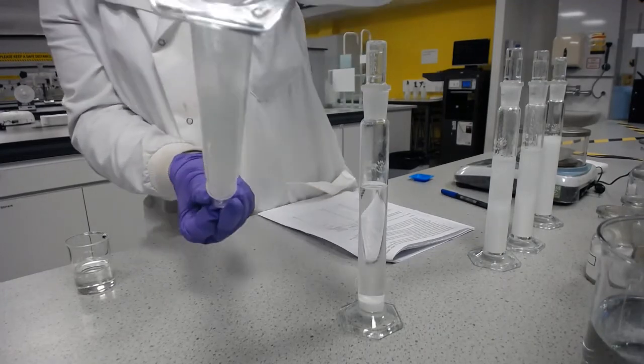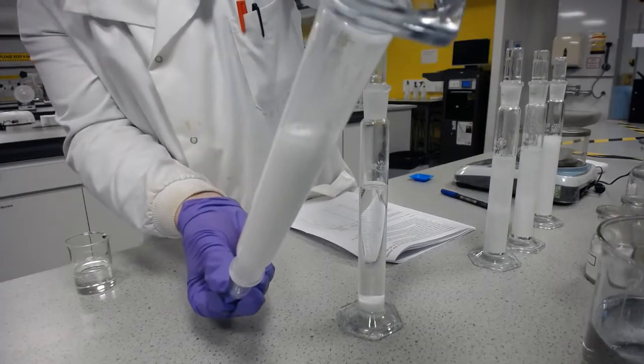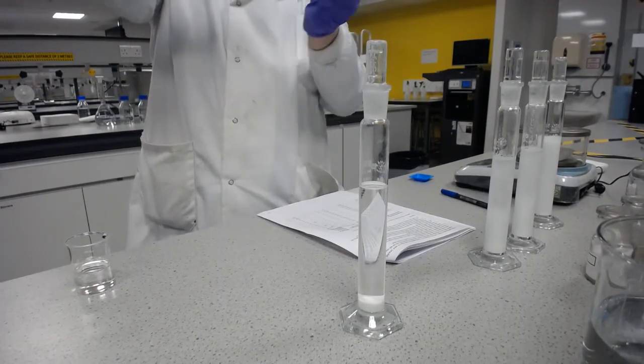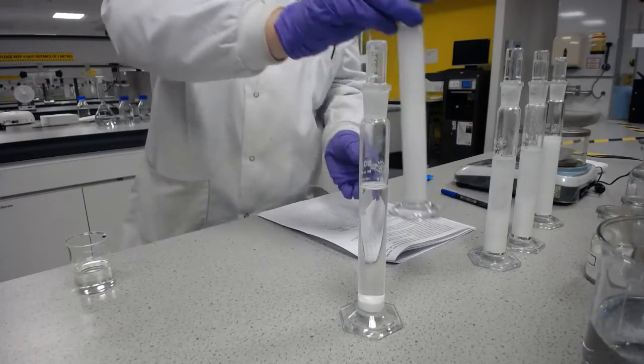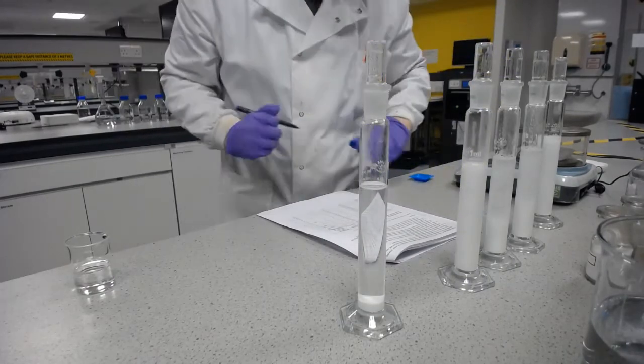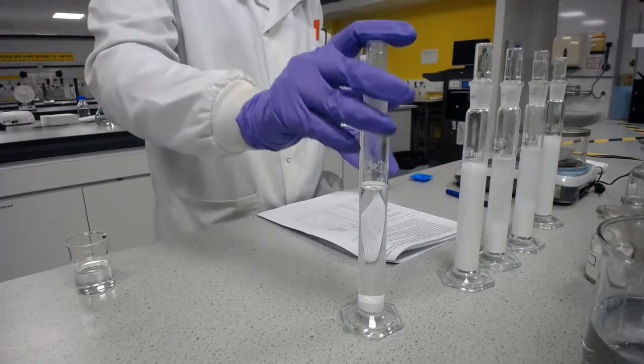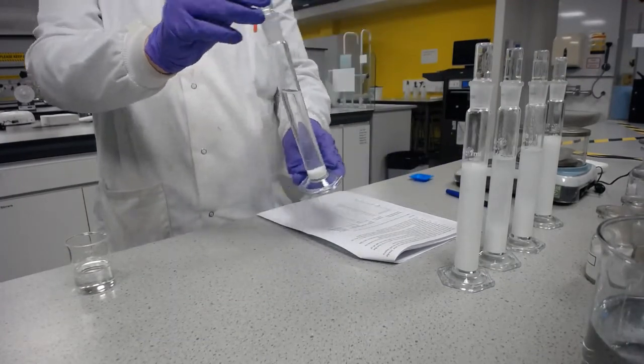Okay, still got a bit of mess there. That's at 9 inversions, and the 10th to me looks pretty good. So that one took 10 inversions. It's getting worse.